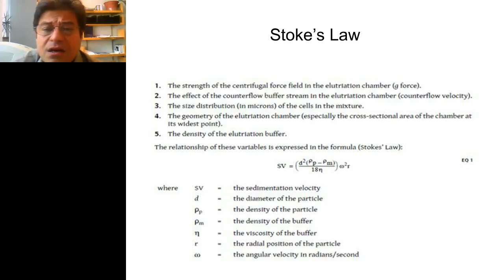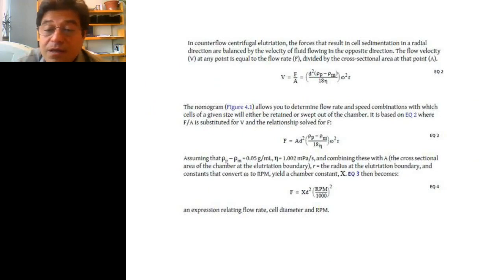There is a link that we've provided on this webinar to the Beckman Coulter manual for centrifugal elutriation, which is where I actually grabbed this information. For those of you who are interested in the nitty gritty mathematics, this just works. This Stokes' law applies to the sedimentation velocity, but that's not all you need, because ultimately what you want to do is a little bit of mathematical gymnastics to get to the final equation, which is down here.